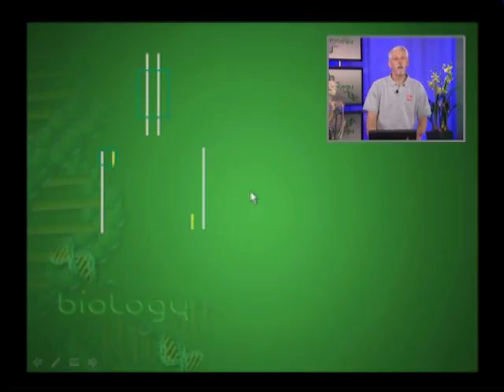That then allows DNA polymerase to bind to those double strands. The DNA polymerase can then build new strands 5 to 3, and at the end of the process we will have 2 copies of our gene at the end of 1 heating and 1 cooling cycle. And then again, it's a very simple process, so still leaving that stuff in the vial, we just need to go ahead and continue the heating and cooling cycles to make more copies of our genes.